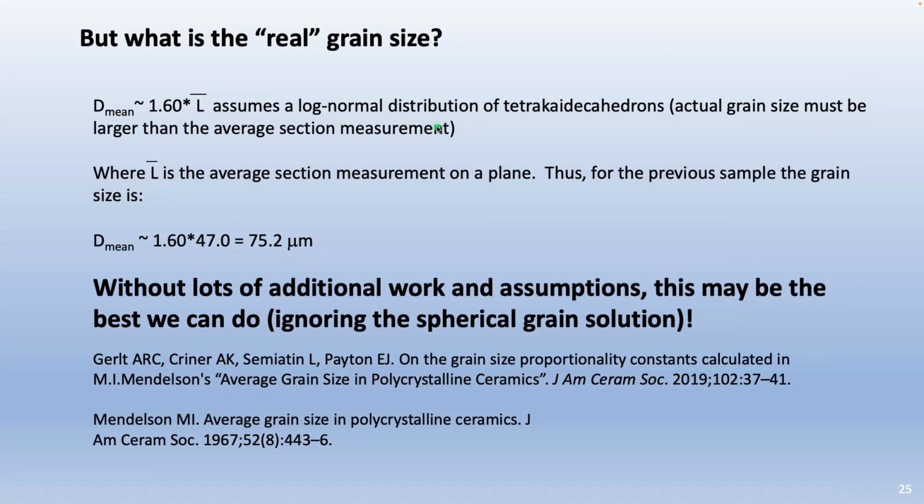So what is the real grain size of these samples? This question is interesting because if you go back and think about a map, the average grain size that we measure from a map, or the average sectional measurement, is going to be smaller than the actual grain size.